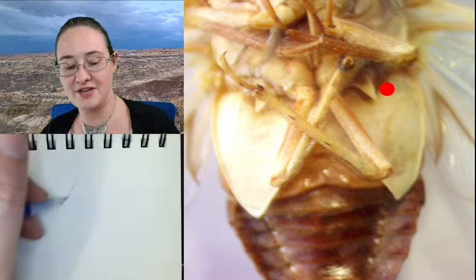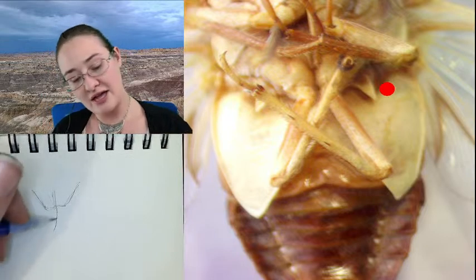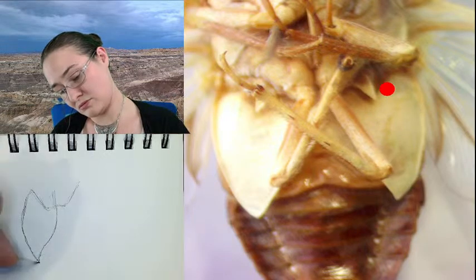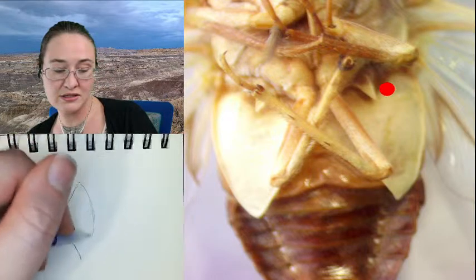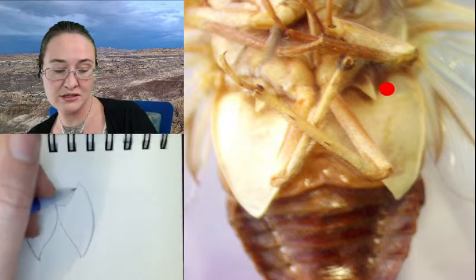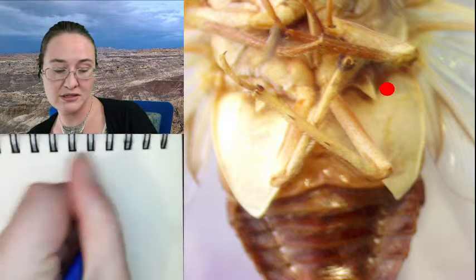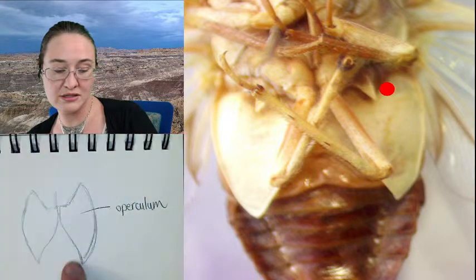These are the coxae of the hind legs. I was giving myself a starting point. So it's this triangle piece and this triangle piece, and these are the operculum. They aren't all the way connected to the body. They're open. So if I flip him this way, he's getting flipped all of the ways.